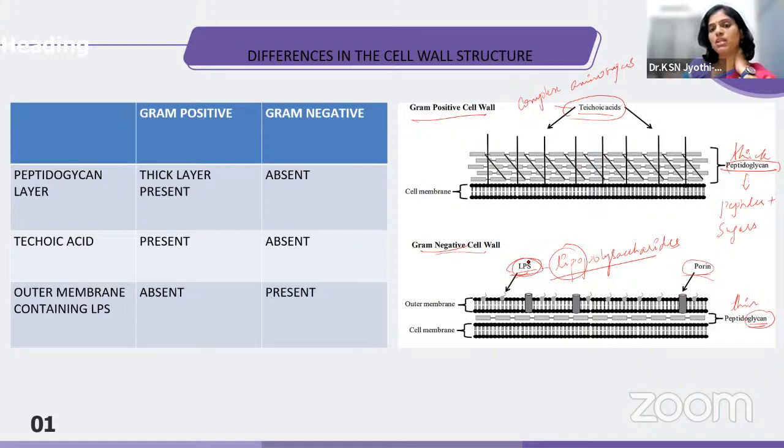So in the treatment after adding the gram stain, when you treat it with alcohol, that alcohol goes into the lipopolysaccharide layers. So therefore, the stain gets decolorized. And when we add a counter stain like safranin, that lipopolysaccharide layer takes up the counter color instead of the gram staining color that is added.